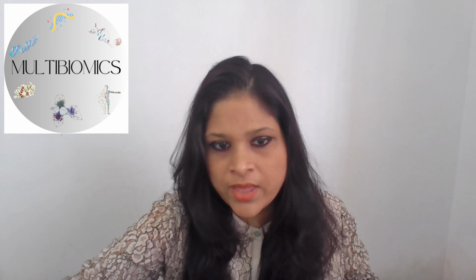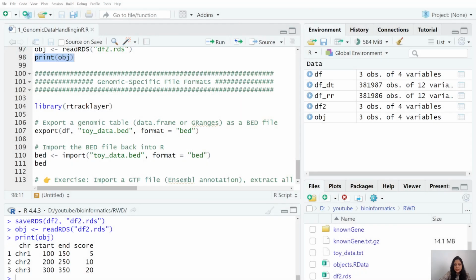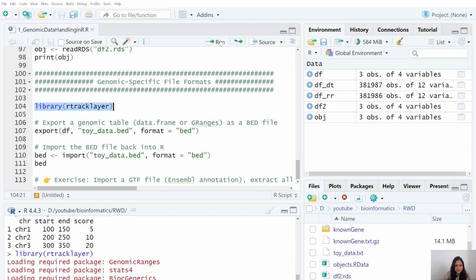Now that we have covered general data handling, let's move on to genomic file formats. We are using the rtracklayer package and we'll export our toy genomic data as a particular file known as a BED file, and we'll also import it back into R using the file that we have generated. Moving on with my script, first you have to load this library, rtracklayer. Run it.